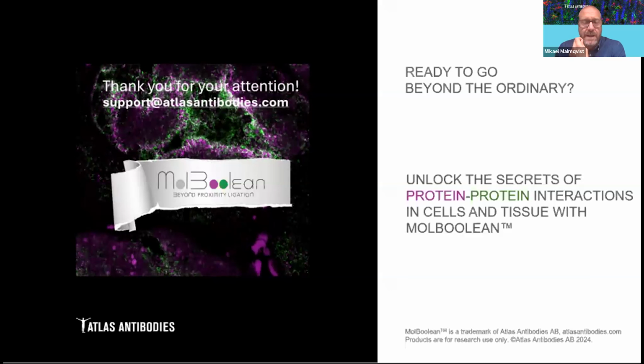And I also want to add that there are protein databases where you can look at the tertiary structure of protein-protein interactions, and you can see where two proteins are interacting in a complex.